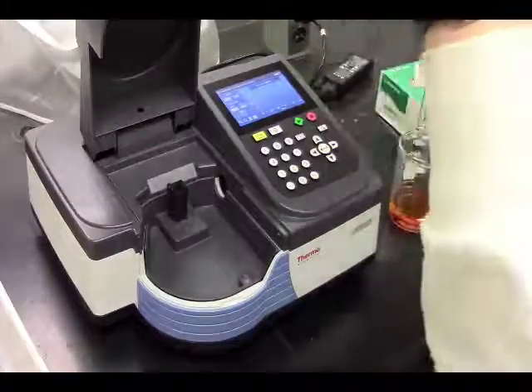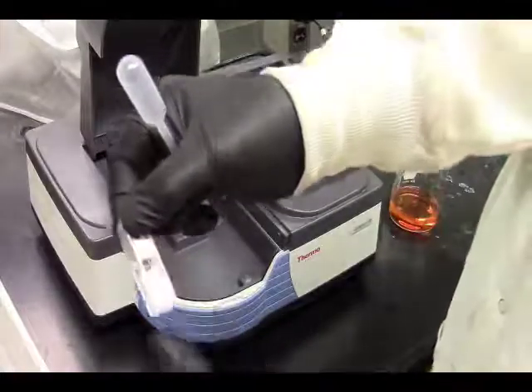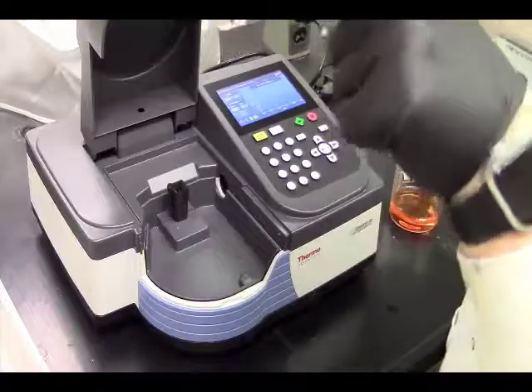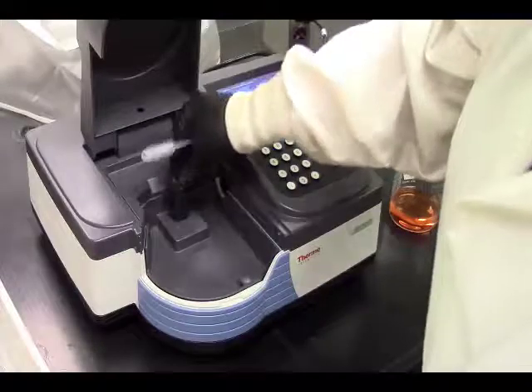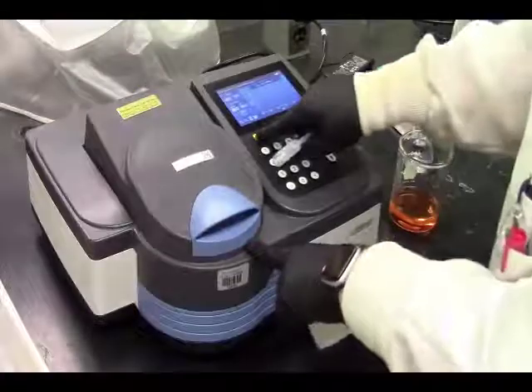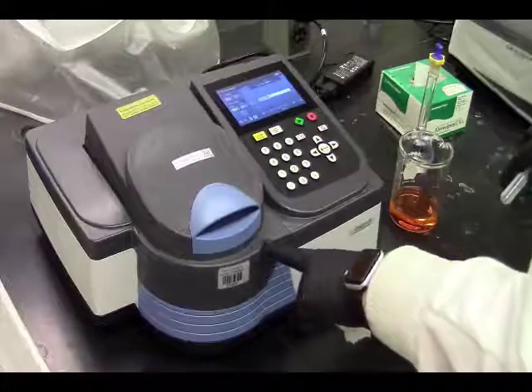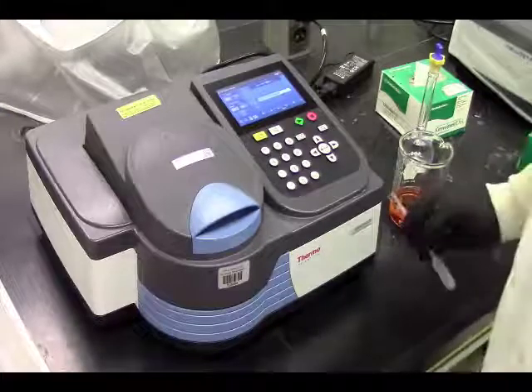This is this way because if you can see this cuvette, this is the path length of 1 centimeter. If you do it this way, you won't get 1 centimeter. So that's why this V needs to go with the flow of the light that's hitting. We're going to put that in. We're going to hit our yellow rectangle for a blank. We're doing this from 400 to 600 nanometers.